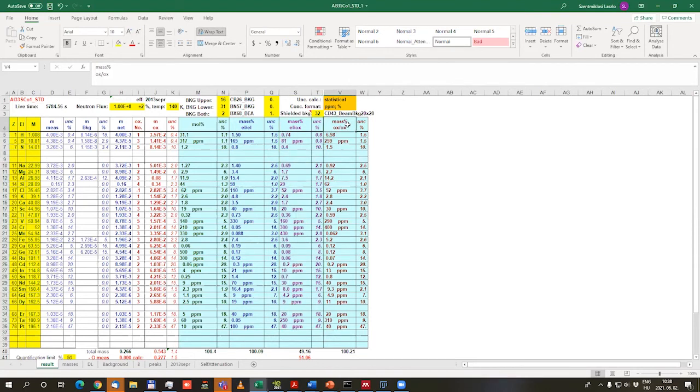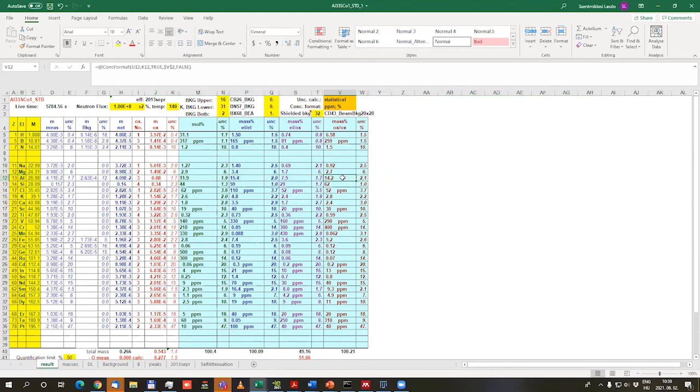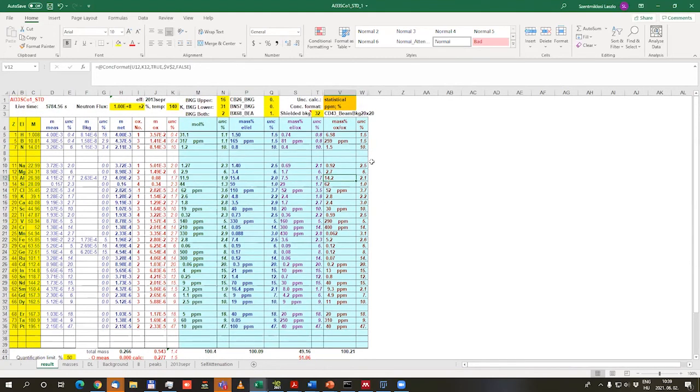And this is the oxide weight per all oxide compound. So in this case, it would be aluminum oxide over all oxides of these elements, because geologists sometimes specify these values rather than these ones.